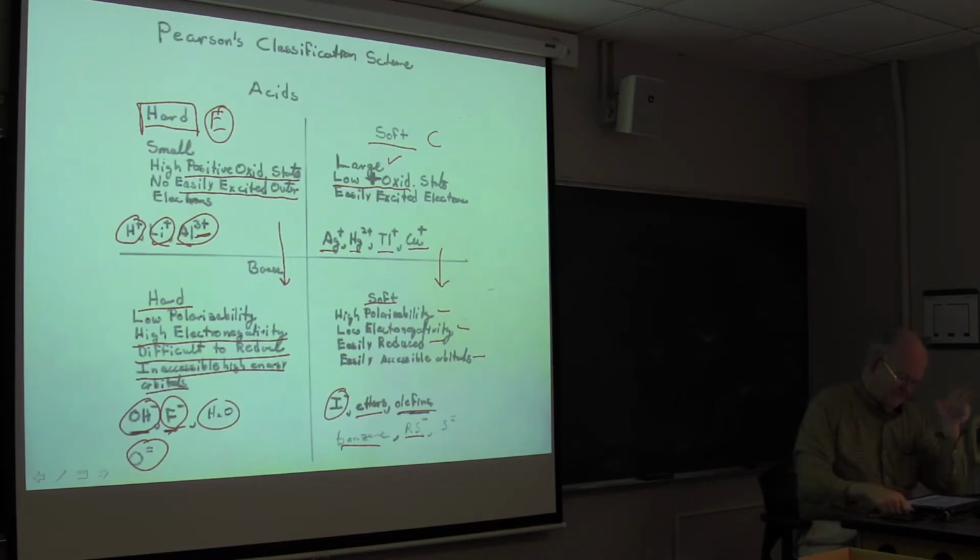And this stuff all comes into play when we start doing chromatography. As an example, in normal phase liquid chromatography and even in gas chromatography, people will add silver ions to the stationary phase to induce strong retention of species that have easily polarized electrons.